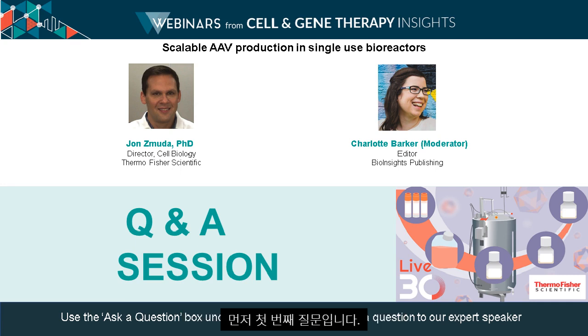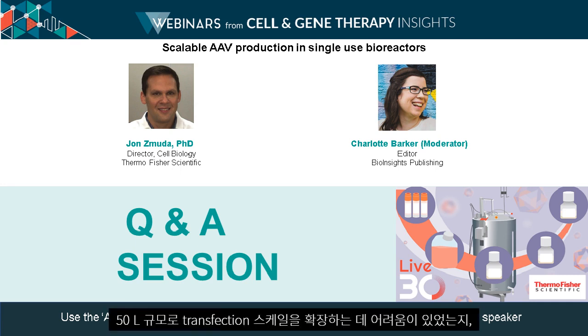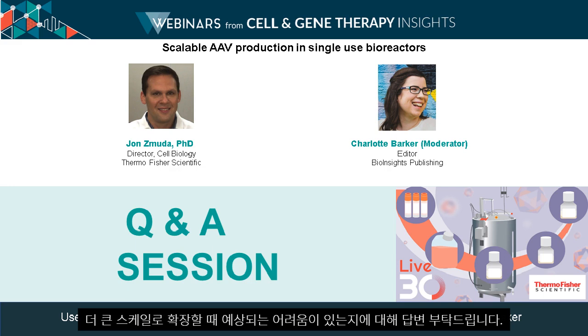So the first question that I've got here: did you have any challenges scaling up lipid-based transfection at the 50 liter scale? And do you expect challenges with the transfection process going into larger scales?